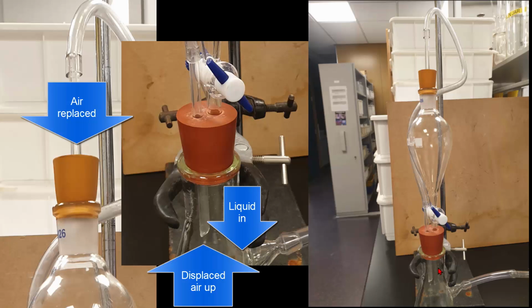And then when the liquid comes out, that decreases the volume, so increases the pressure. That's equalized by the air going up. So there's no vacuum created here and there's no pressure created here. And so it's pressure equalizing, so the pressure stays the same throughout the whole system. Dropping the liquid in there doesn't increase the pressure and it also doesn't allow gas to escape.